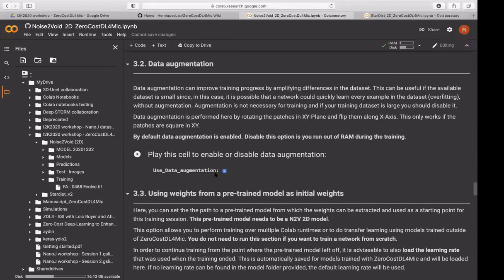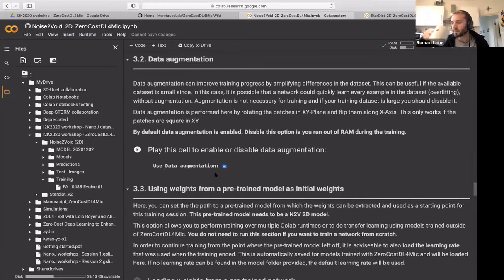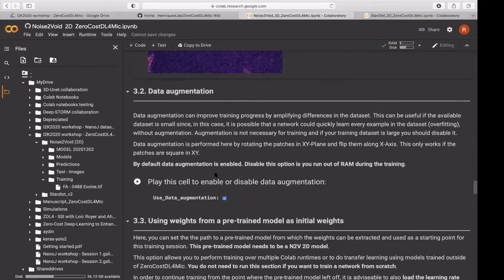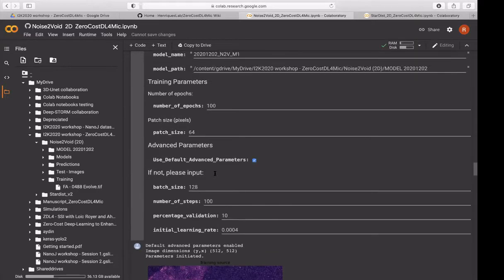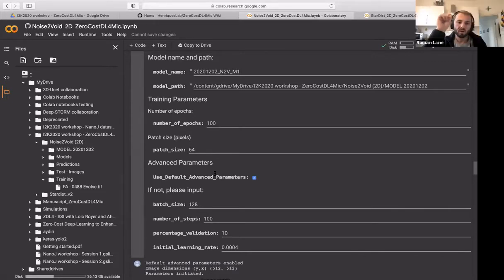Next step, and you. Question? Yes, sorry. Can I ask a question? Of course you can. For the batch size, is there a specific strategy for that? Does it happen to coincide with, for example, the size of objects that you want to recognize, or is it just kind of guesswork what that would be? So in this particular case, and actually very often, your network will work best if it gets many examples.